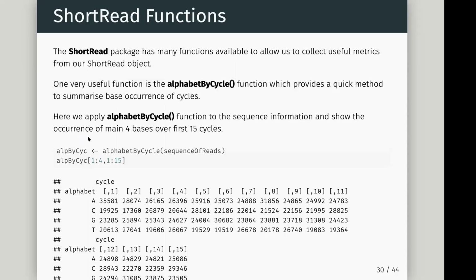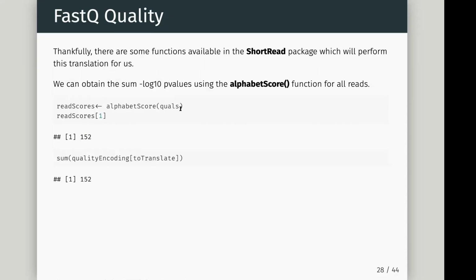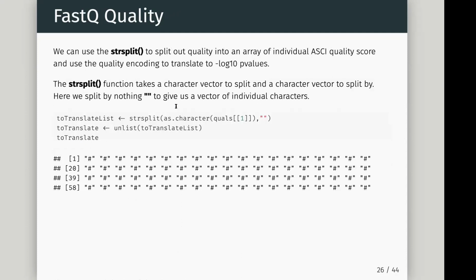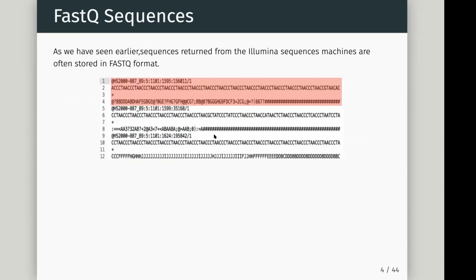We're going to show this, I think, perhaps in the exercise, so it's kind of safer there. But another really useful thing to do is not just to look at the sum quality across a read. Okay, so maybe a read overall is bad, it didn't sequence well. But like I said, reads will get poorer quality over time, over cycles, being the first cycle, the first read we sequence, sorry, the first position base we sequence. As we move along, all these reads, quality will drop off over time. Okay, and we want to capture that.